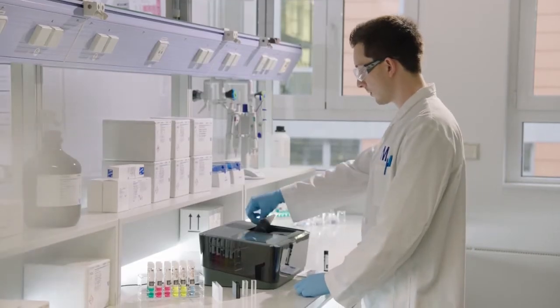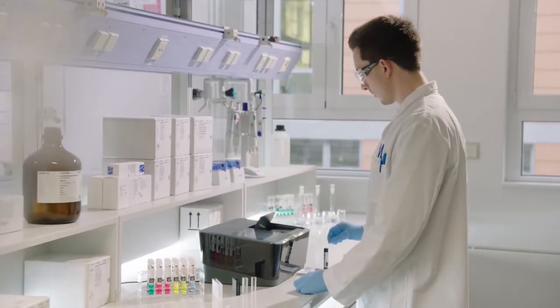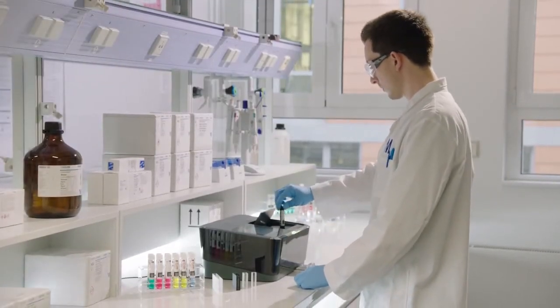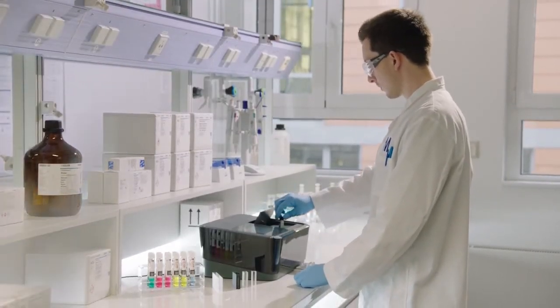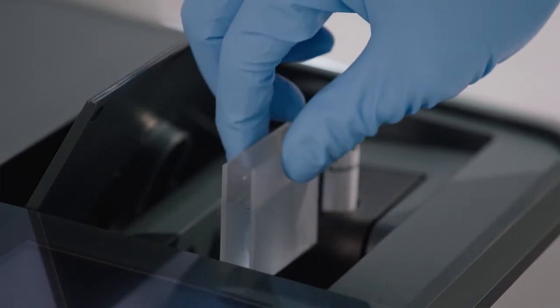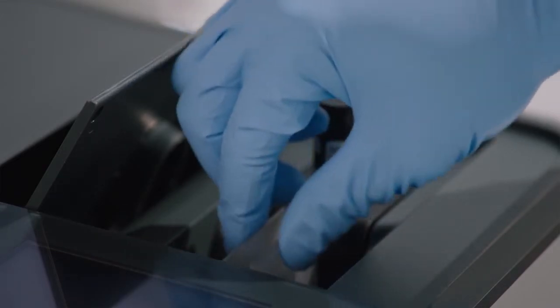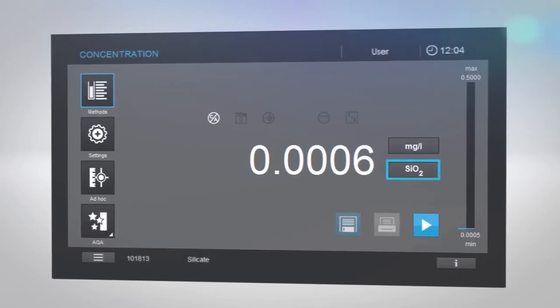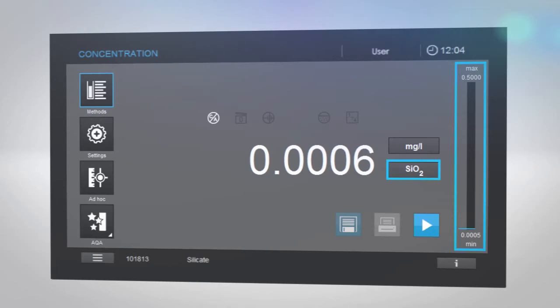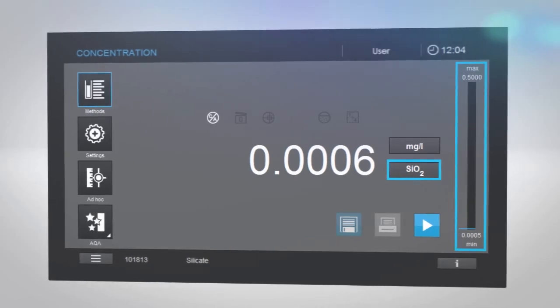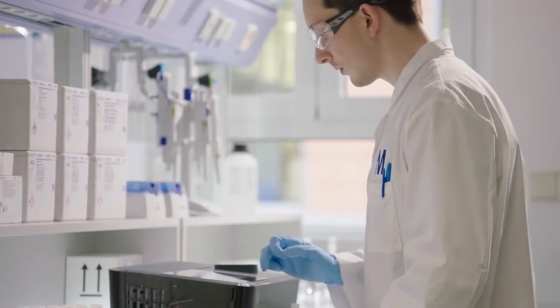Open the lid and insert the auto selector, then place your cell in the measurement area. SpectraQuant Prove will automatically adapt the measuring range to the size of your cuvette. The new mechanical cell size recognition is more durable and reduces errors.